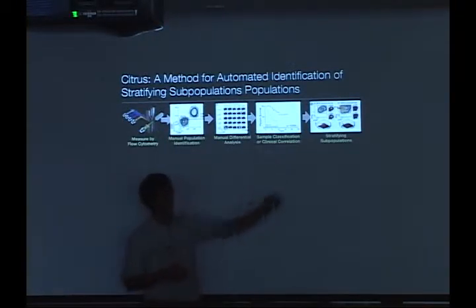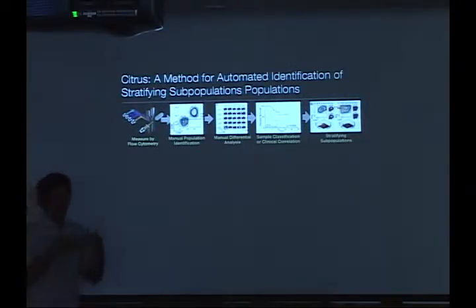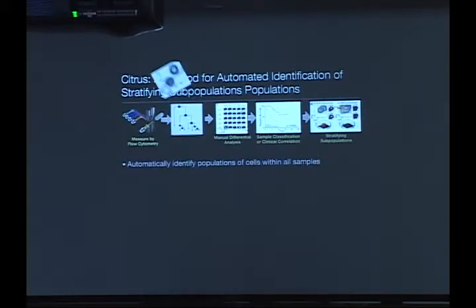And then you test to see if that feature that you've quantified is somehow predictive of your clinical endpoint of interest, or you use, say, a t-test to say, is the abundance between these two patient groups different in this cell subset? And that's really how you arrive upon that cell subset that you're interested in exploring further.